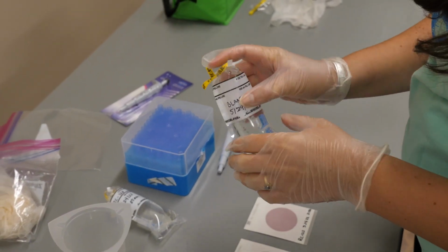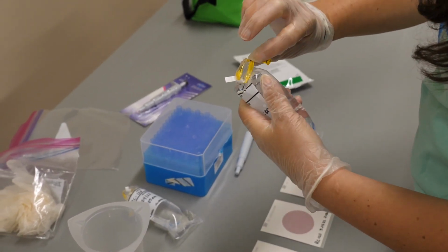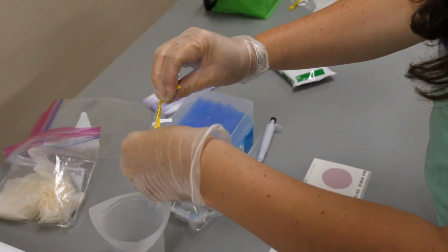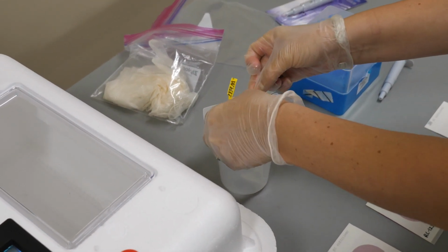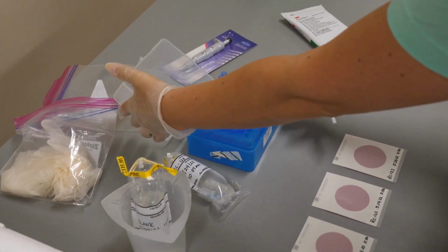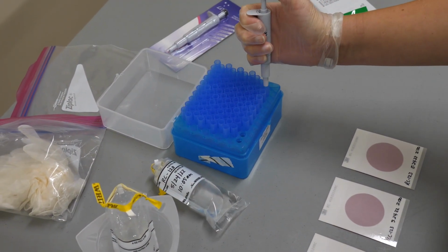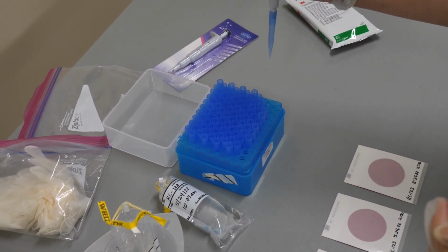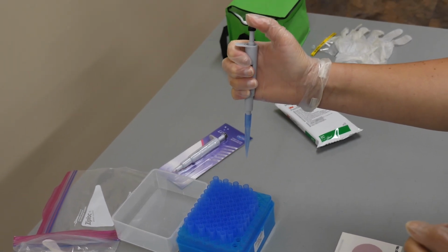Gently shake the Whirlpack bags to stir up the water samples. If needed, place the bags upright inside of a cup to prevent them from falling over. Next, gently place a sterile tip on the pipette using only the pipette itself. Be careful not to touch the sterile tip with anything else. Always keep the pipette vertical, especially when there's water in the sterile tip.